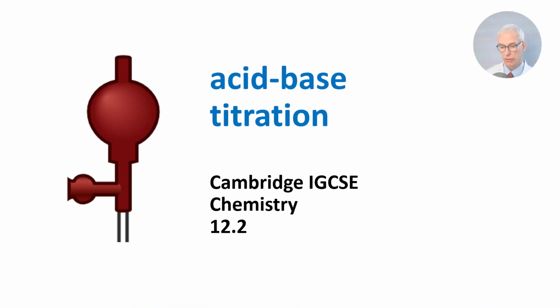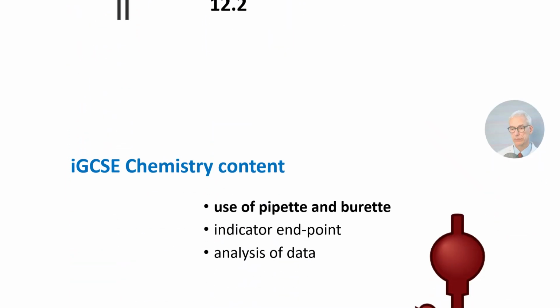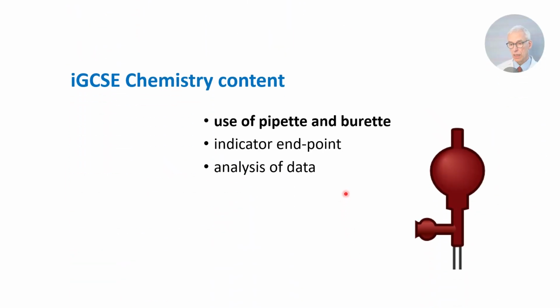Acid-base titration for Cambridge IGCSE Chemistry. IGCSE content includes the use of pipette and burette, indicator or titration endpoint, and how titration data is analyzed.